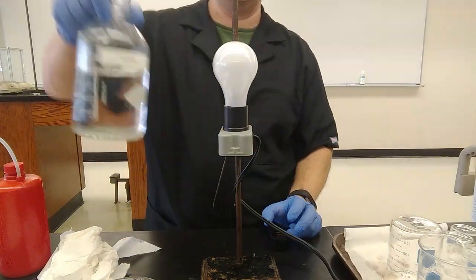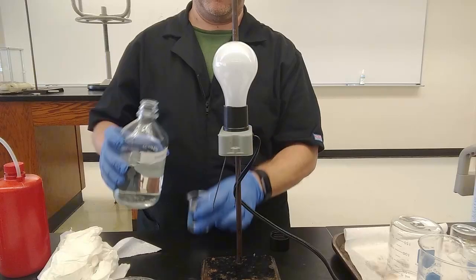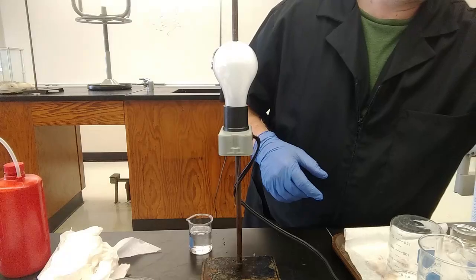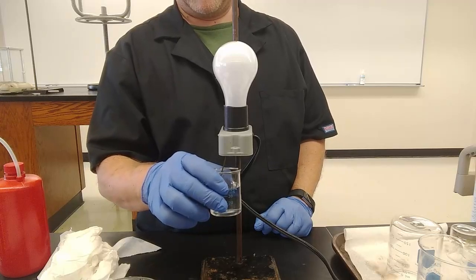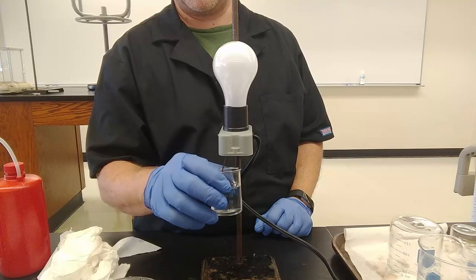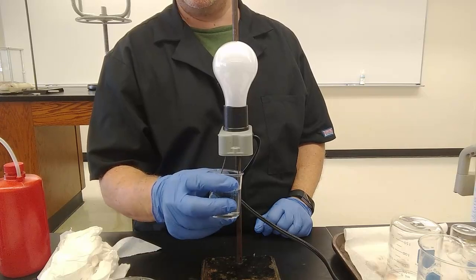So let's try sugar water, a sucrose solution. Bottoms up. Nothing. Absolutely no light. Why? Well, do we see any metal in sugar?